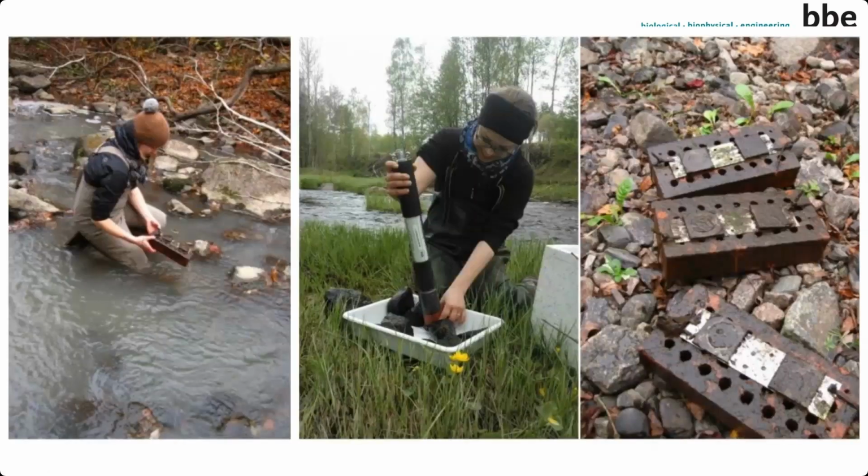You see here some examples, and many people use artificial substrates, for example tiles, and they measure them outside of the river. Most people use these tiles, which makes it much easier to determine. In these tiles, you do not have these caves, and it makes it easier to get real results which are representative for the ecological status.